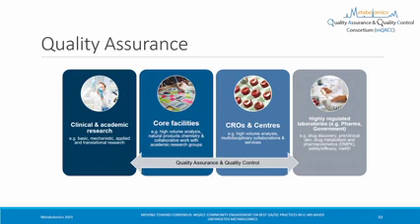Even more so enhanced in CROs and larger centers who do a higher volume of analysis, doing really multidisciplinary collaborations, offering services at a higher level, let's say. And then finally, we have highly regulated labs, pharma, government, et cetera, where just by nature of who they serve, the bar for quality assurance, for auditing, and for following standardized protocols is much higher, because of the potential downstream impact, the decision-making that might be made based on that analysis, right?